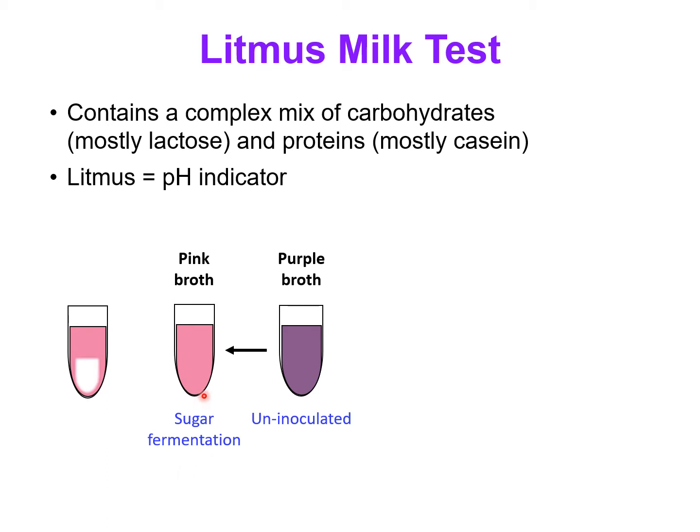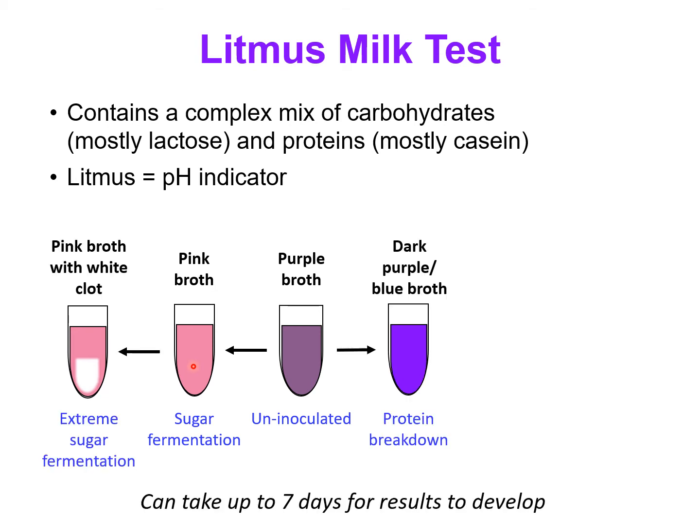But what we usually do is we take this test tube right here, this pink one, and we actually stick it back in the incubator for a few more days, just to see, okay, if anything is going to change. Now, let's say you did that, right? You took this test tube and you incubated it for an extra couple or 3 days. What you could see is something like this.